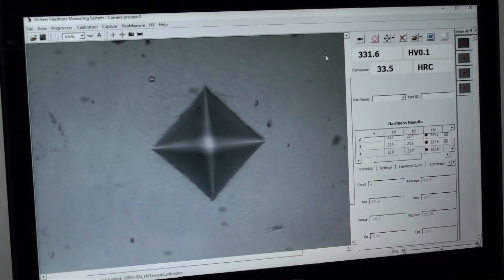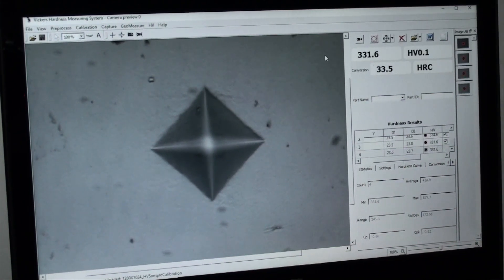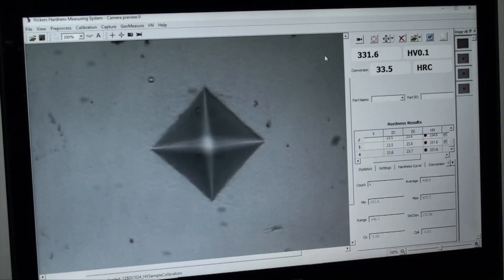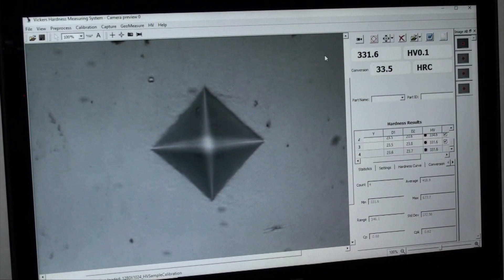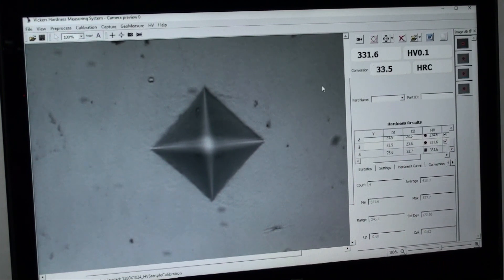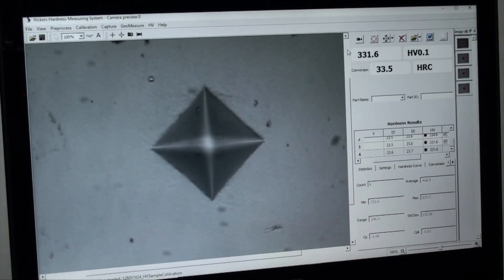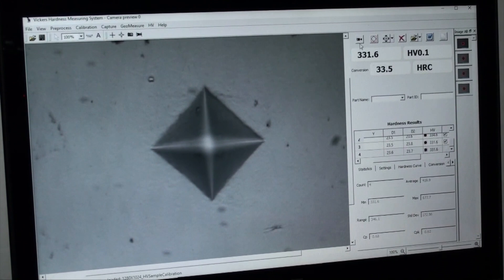Once your test is completed, you can move the position of the digital stage micrometer to find another position to take another test. But let's review more of the digital interface.